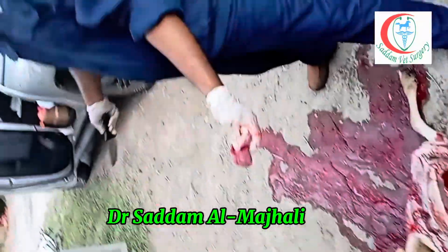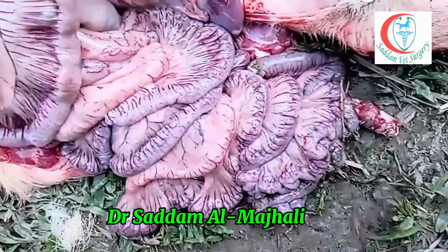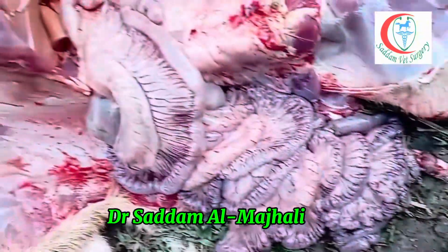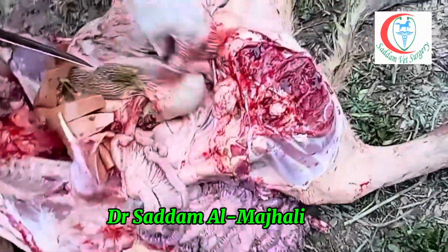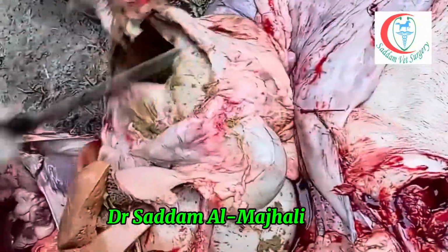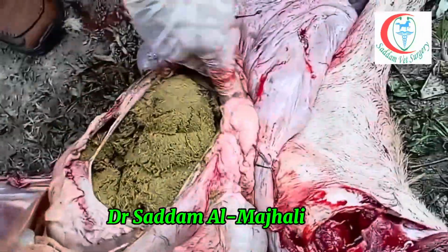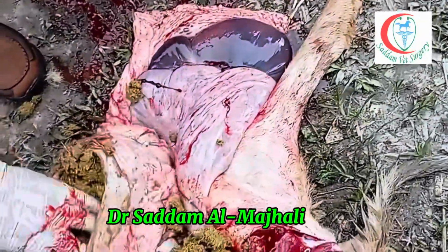Why no eating? Nobody says. Intestinal. You want to check the rumen contents also? Can open. But actually, she ate some food.